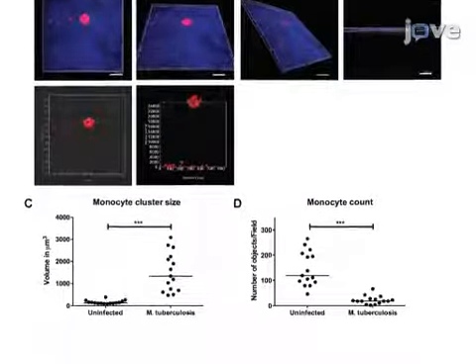tuberculosis-induced early granuloma. The main advantage of this technique over existing methods such as in vitro monolayer of cells is that the cells in this system are present in a 3D microenvironment, allowing the formation of granulomas upon infection with virulent mycobacteria resembling human TB.